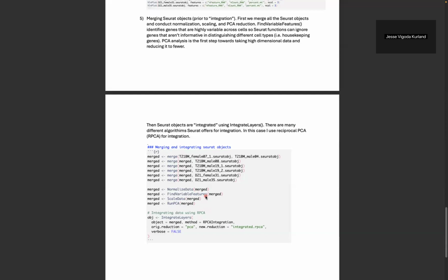And so it's using these variable features to eventually generate the clusters and do all downstream analysis, as opposed to using all genes, where really there's a lot of genes that we don't care about, genes that are going to be ubiquitously expressed across cell types, because ultimately we want to identify different cell types. And so we're going to look for the genes that show high variability across different populations. And then we're going to scale these count matrices and then run a principal component analysis.